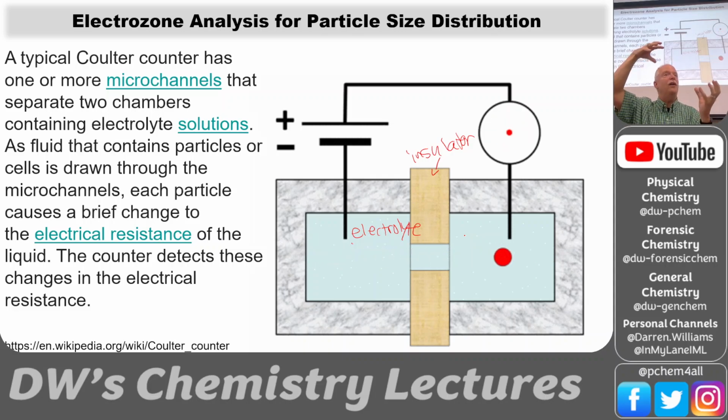So you got a big long needle passing through there. It's going to be really hard to determine if that's a needle or a sphere or whatever. So the assumption is it's just a sphere, and so we'll get the effective spherical diameter of that particle, even if it's a needle. Okay, so you probably want to look at it with a microscope to see what your particles actually look like if you're doing electrozone analysis.